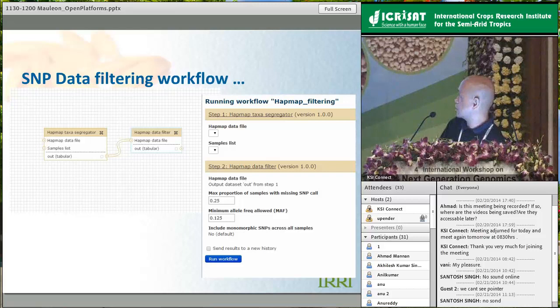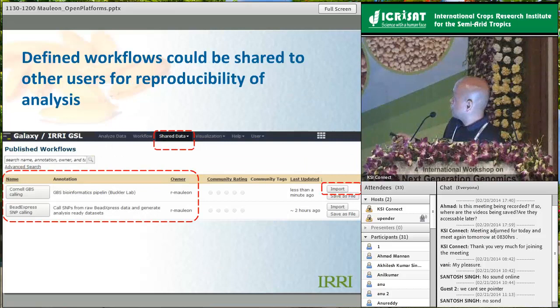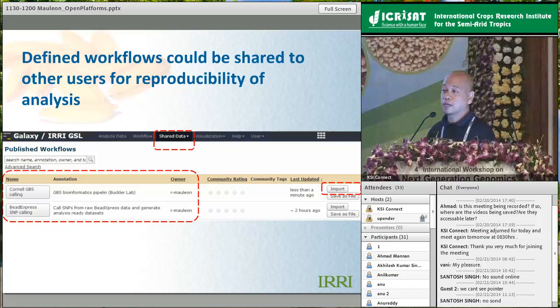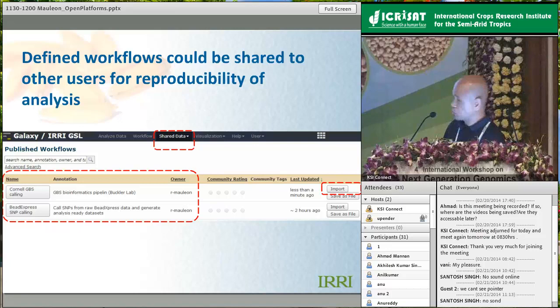This is another sample - it can be as complex as a multi-step workflow or as simple as a two-step analysis defined in Galaxy. Galaxy's shared data feature also allows you to publish workflows, making them publicly available. Any registered user in IRRI Galaxy can log in and fire up a workflow already defined internally, or if you have a publication stating your analysis steps, we could host it here and anyone could replicate your analysis. We have the GBS calling pipeline and the Illumina SNP calling pipeline available.